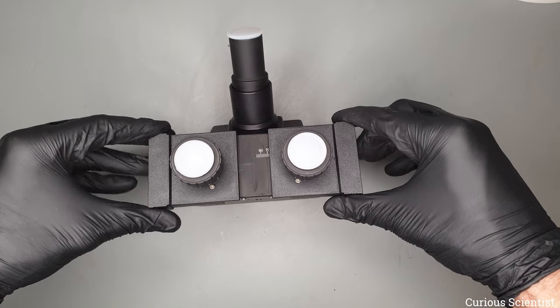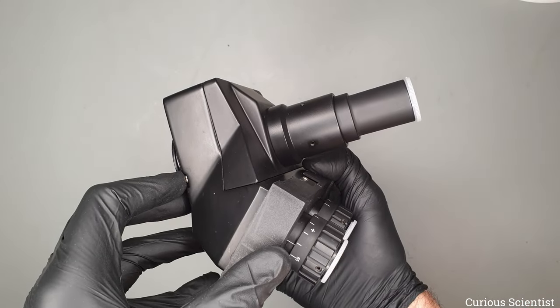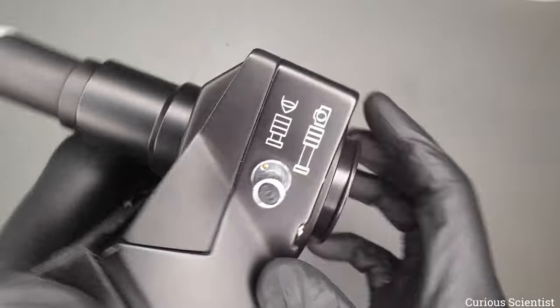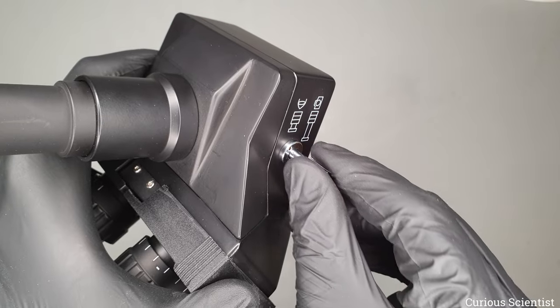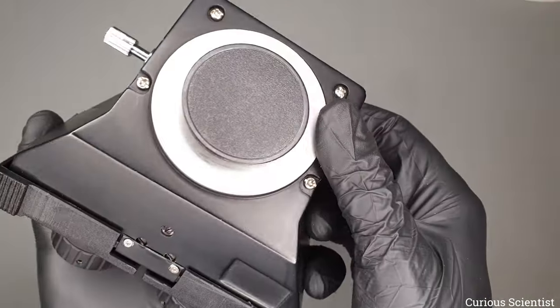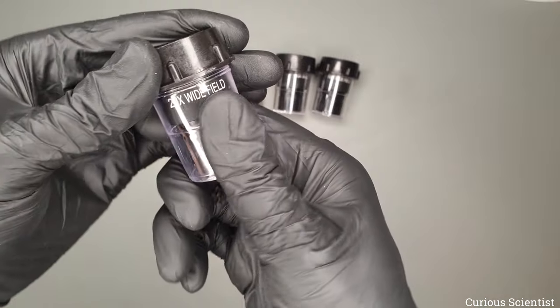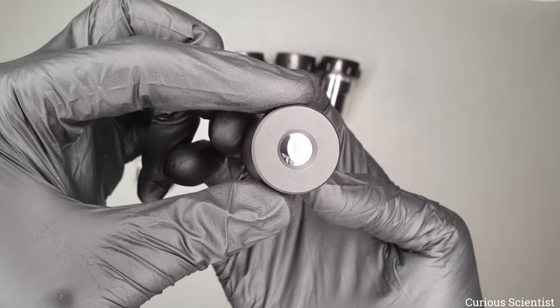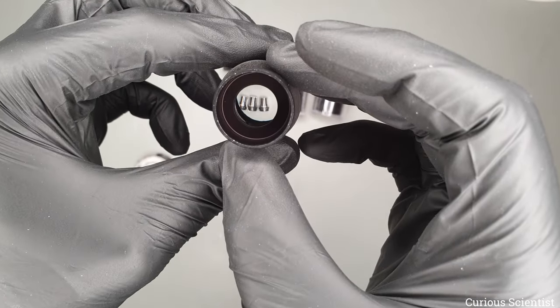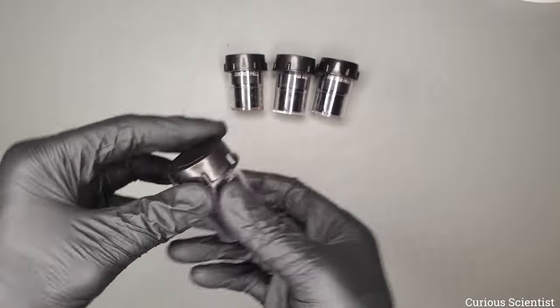The trinocular head allows you to adjust the interpupillary distance — the distance between your eyes — so it works for both wider and narrower eye spacing. On the side there is a small pin: pulling it out lets you look through the camera, and pushing it in lets you look through the eyepieces. The eyepieces are a mix of metal and plastic. Opening a tube reveals the 20x wide field eyepiece — one end for viewing the specimen, the other side goes into the trinocular head.